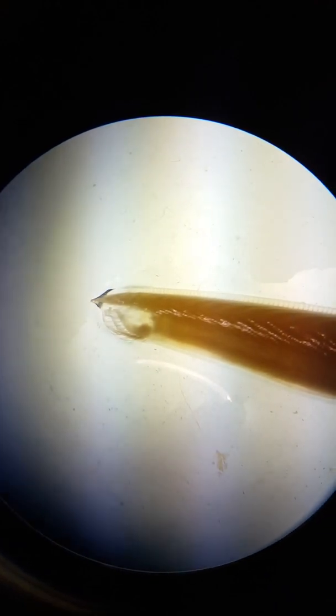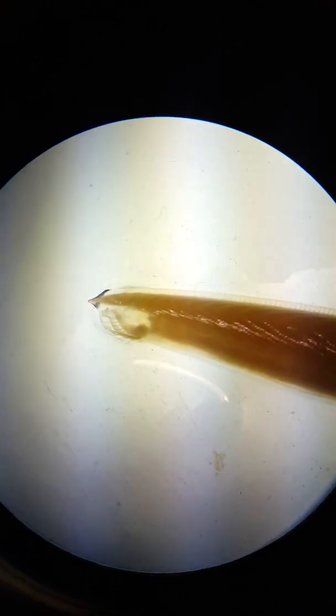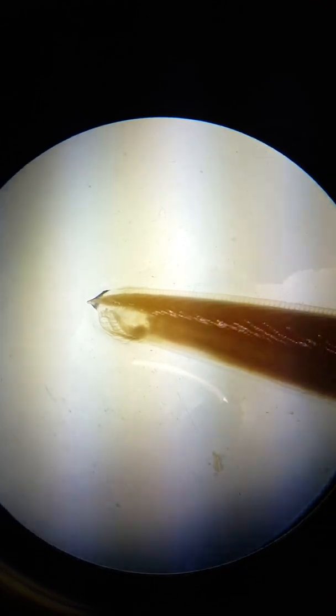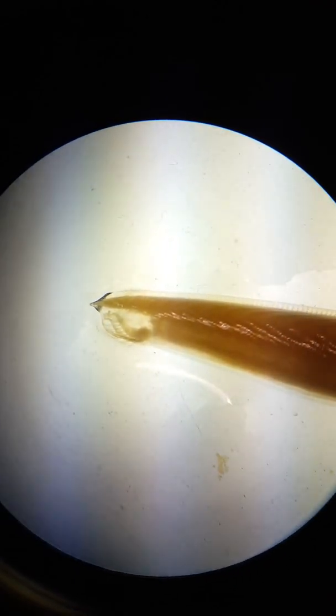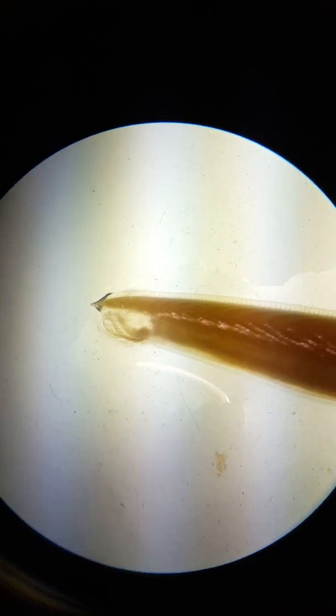Here is the mouth end of a lancelet, and you can see quite clearly those mouth oral papulae around the hood.